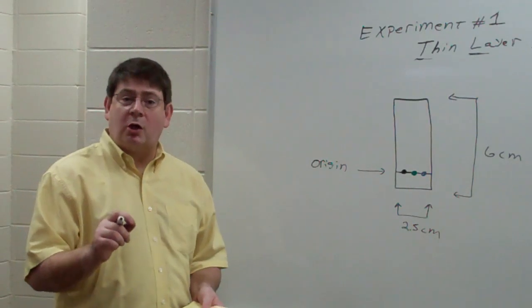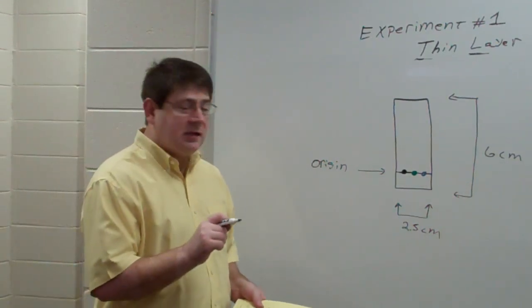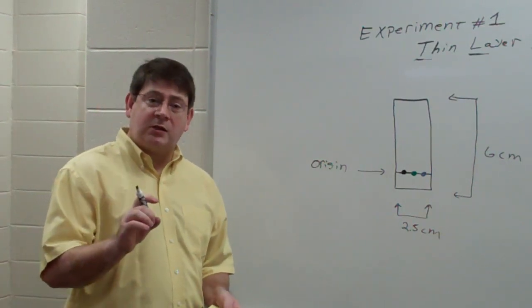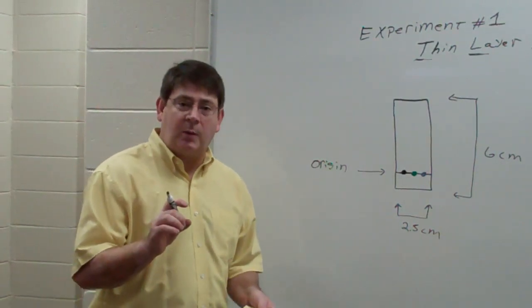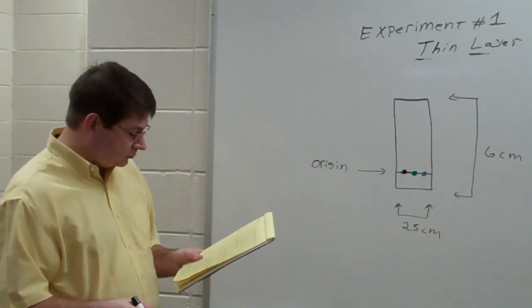Your TA is going to show you the technique of spotting. Spotting is actually an art, and it takes a little while to get used to it. You don't want spots that are too big, and you don't want spots that are too small. And so it takes a little bit of practice, and your TA will actually teach you how to do this. Okay?